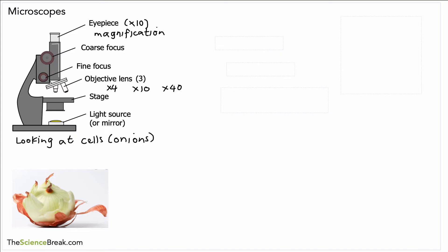In terms of how we would do that, the first thing you need is a glass microscope slide. Then once we've got that, we would take our layer of onion cells that we have peeled off the onion and we will place that very carefully with our tweezers, keeping it as flat as possible onto the slide.